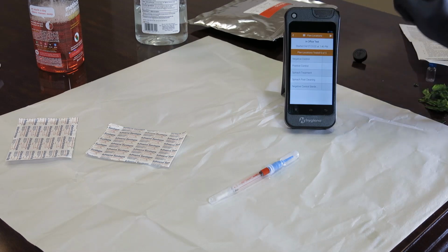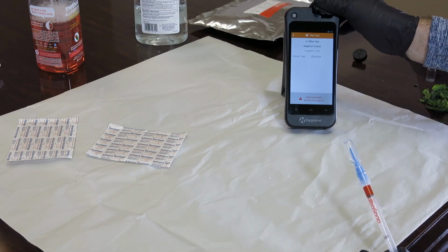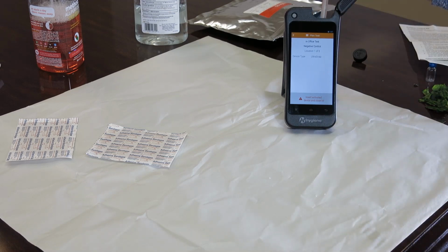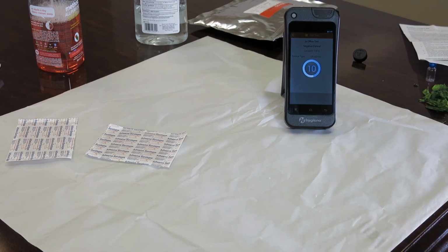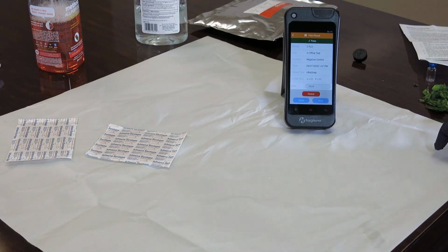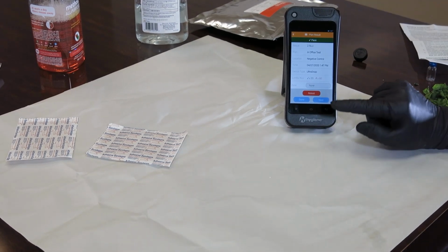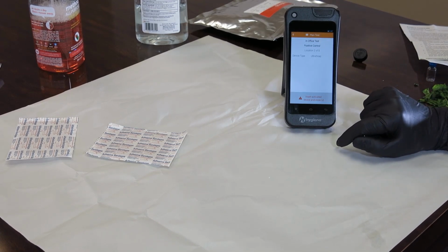So let's do a negative control first. This is an easy one. You can just take the Ultra Snap, drop it in there without breaking the top here, and run the test. So we're reading 2 relative luminescence units, which is well within spec. We're going to press next, and that should take us into the positive control.